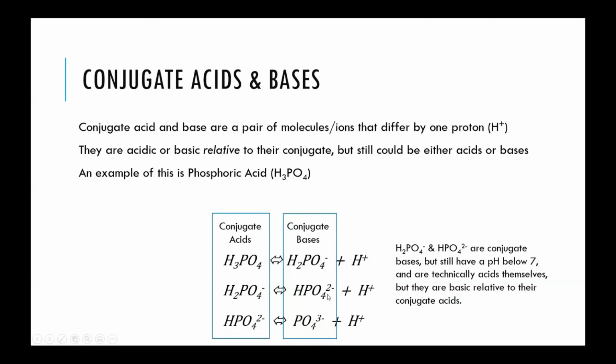And mixing these together in specific ratios, these are able to buffer against pH changes.